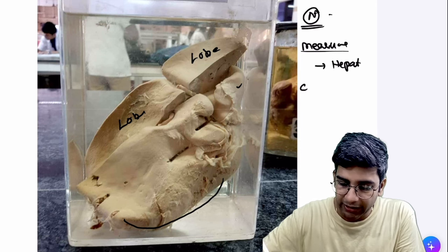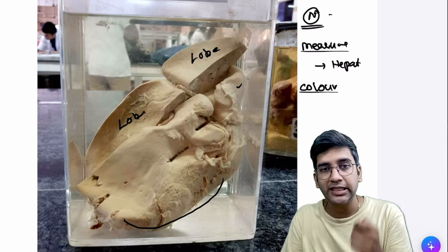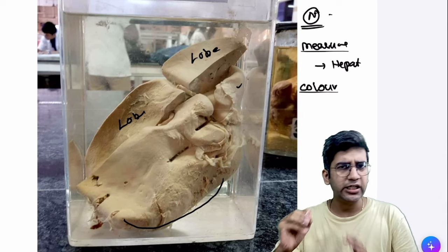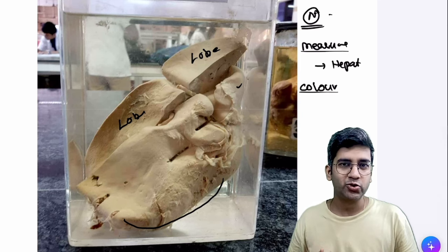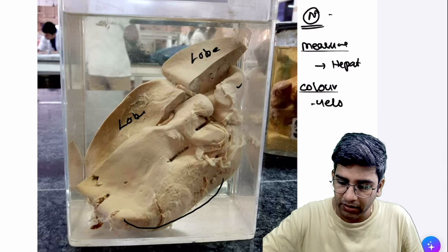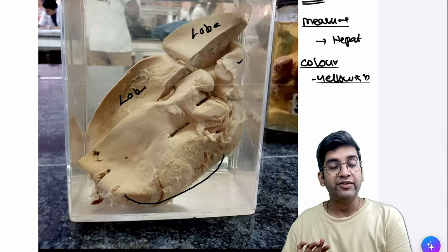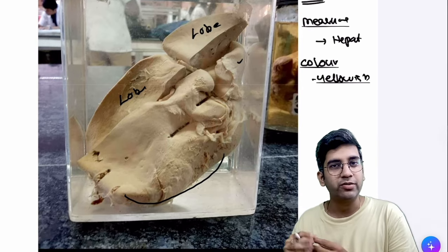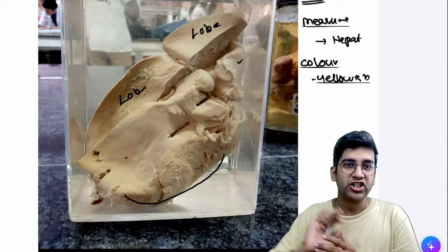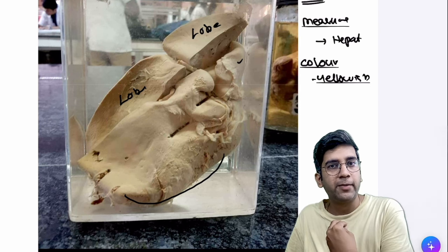Next, comment on color. In a jar-mounted specimen, unfortunately one important thing I cannot assess is consistency. The color of this liver is grossly a little bit yellowish — it's a yellow-colored liver. The normal color of the liver is brownish to greenish, and if fresh, reddish to brown due to vascularity. So this is a yellow-colored liver with gross hepatomegaly.